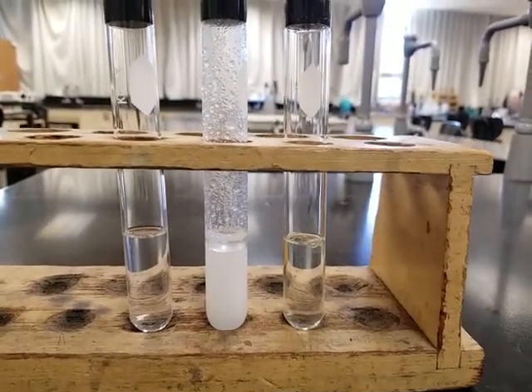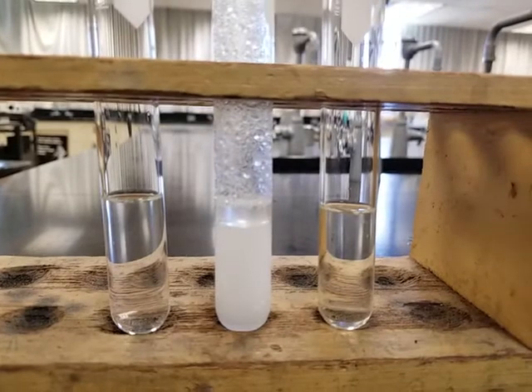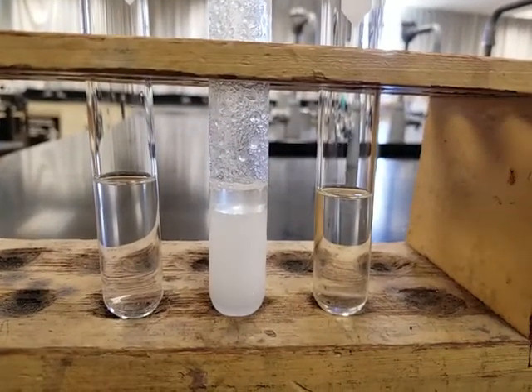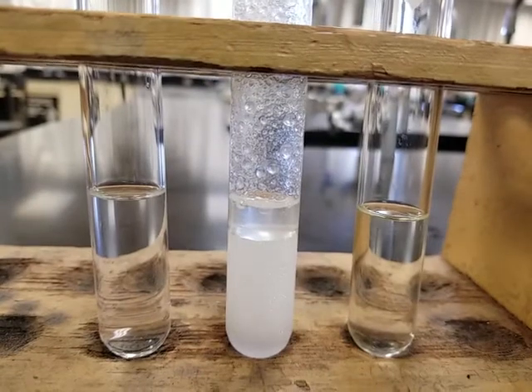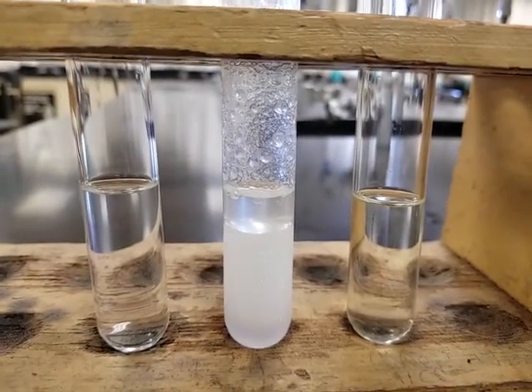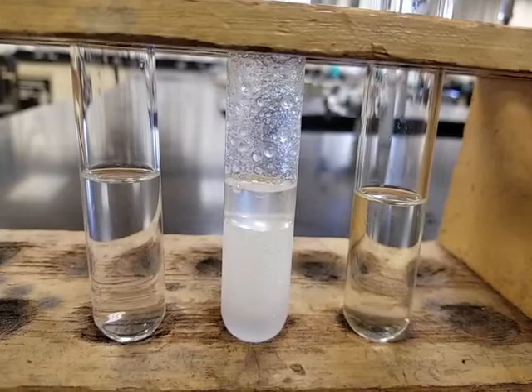Look at it. What do you see? One full minute, 1 entire minute. Just look at the whole thing. Has it been 1 minute yet? No, okay.